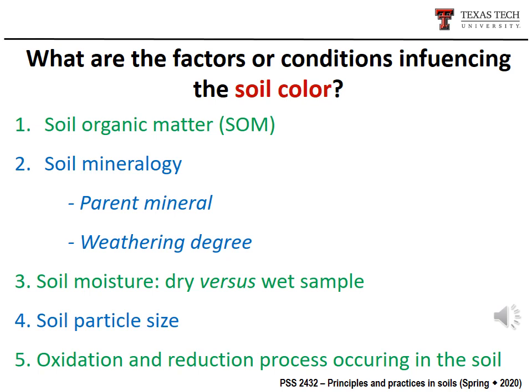Another factor is related to water content or soil moisture. And the soil color is totally different under dry conditions or wet or moist conditions.